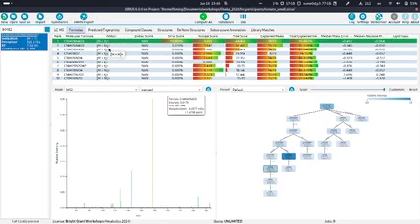I would say in general, the explained intensity should usually be above 0.8 for MS2 spectra. Otherwise, it's suspicious at least. It could be a noisy spectrum, it could be a chimeric spectrum. In this case, the explained intensity can be lower, but you would expect that most peaks in your spectrum should be explained by the fragmentation tree. Otherwise, I wouldn't trust the molecular formula annotation. We'll also soon see an example where we probably shouldn't trust the formula.